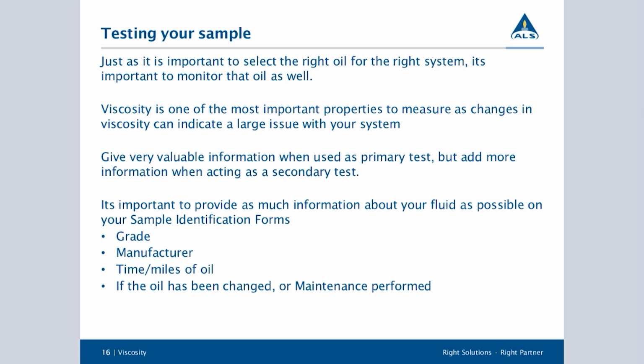If you just tell us, here's an oil sample, we don't know the grade, the manufacturer, or the time on the oil, all I can tell you is what your viscosity is that we've measured it at, and things like that. But if you tell me that you're running an SAE 15W40 and that you've been running it for 3 months, 6 months, however long, or even how many miles you've had on it, I can start to say it's recommended that you change your oil now, or yes, I am seeing fuel contamination in the system. This is my recommendation for changing it.